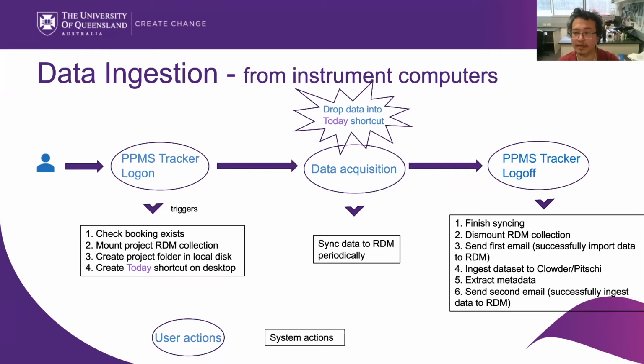It will sync the data in that Today shortcut into the project's RDM. And later on, when we roll out, we will customize this syncing period according to the instrument characteristics. And once the user logs off, the system then finishes syncing.